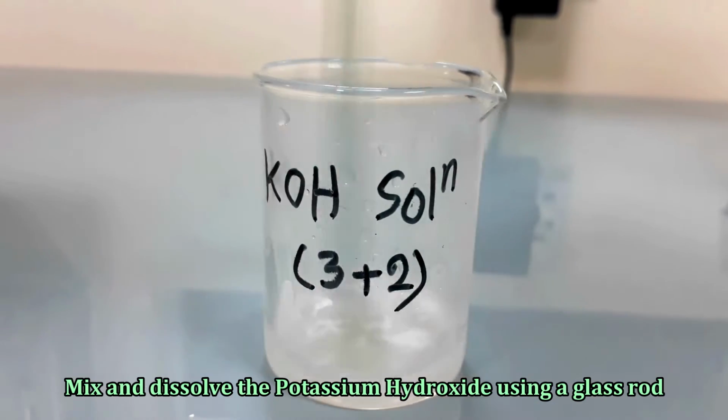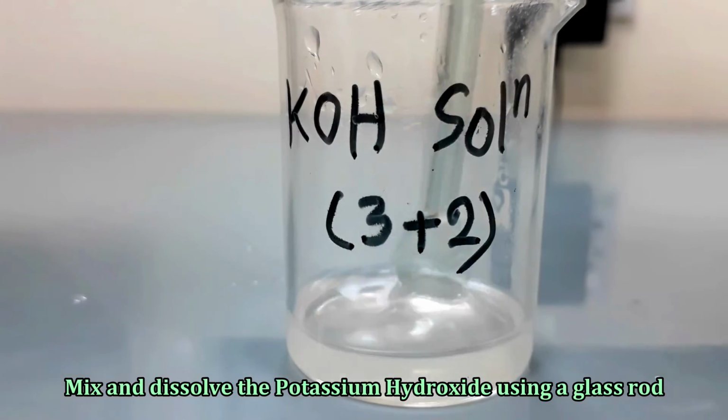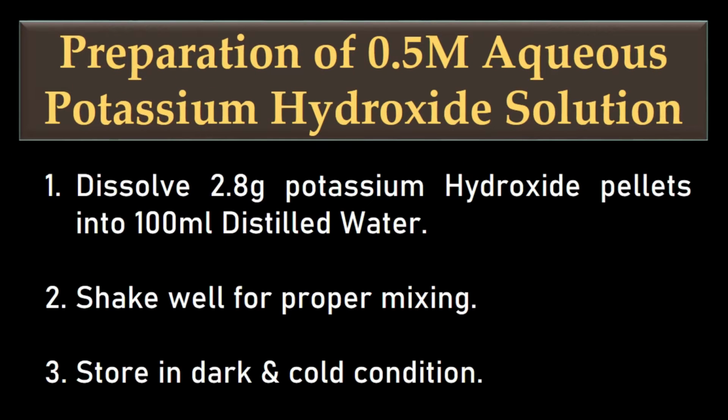Mix the content using a glass rod to dissolve the pellets into water completely. To prepare 0.5 molar aqueous potassium hydroxide solution, just dissolve 2.8 grams potassium hydroxide pellets into 100 ml distilled water.